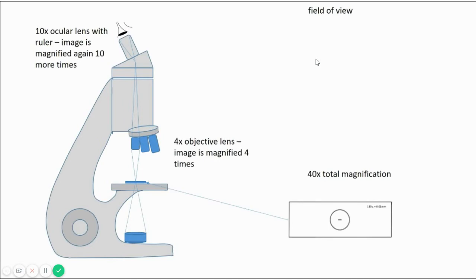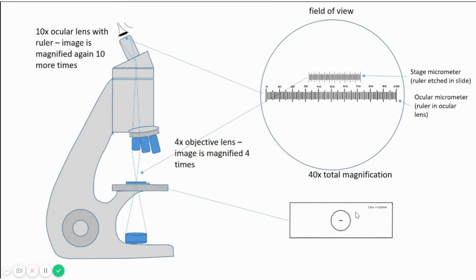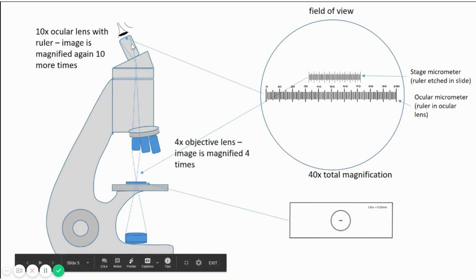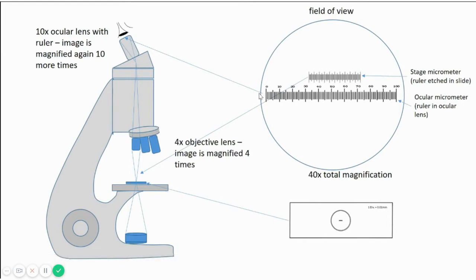Right now on your stage, you have kept the stage micrometer which looks like this, and you are now going to see something like this. In your eyepiece, your eyepiece graticule is already there, which is this one. Look at the arrow. Your eyepiece graticule scale is visible because it is in your eyepiece lens. You have kept the stage micrometer on the stage, so you can see the stage micrometer scale also. You can see two scales now. This is at 40x.